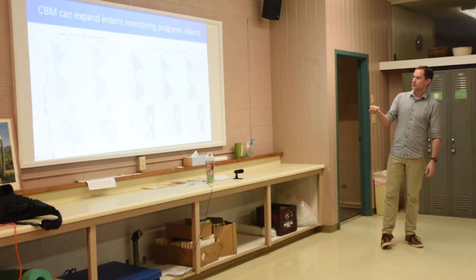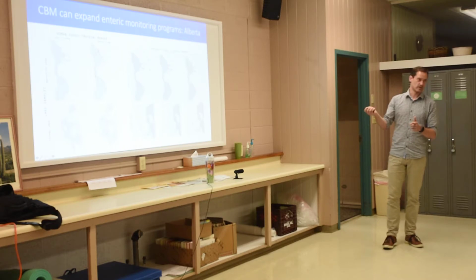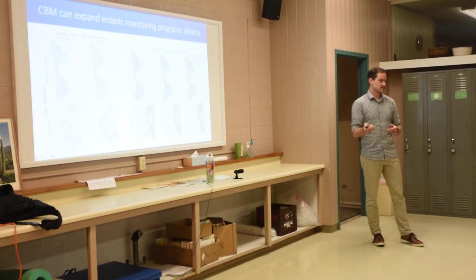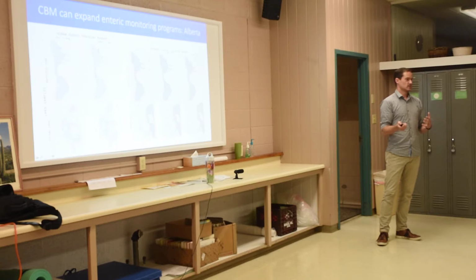So here we would have a single sample collected from each lake that we could build off of. So that would be $300 and then $50 for the ruminant marker. So $350 per sample. They have 2 different dates collected, let's say, and we have about 75 sites. So it adds up to over, I think it's something like $26,000 once you add it all up.